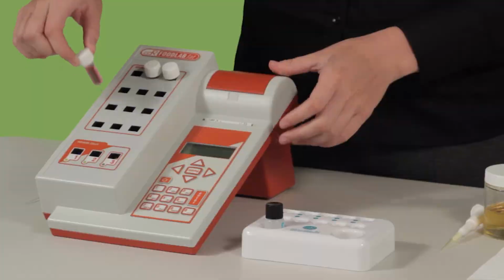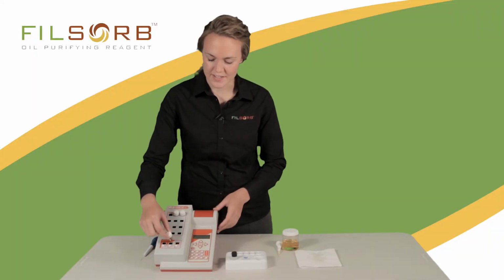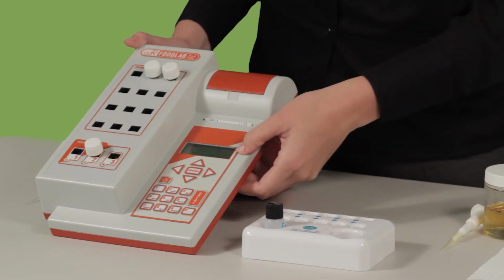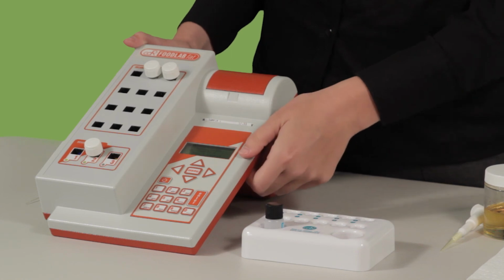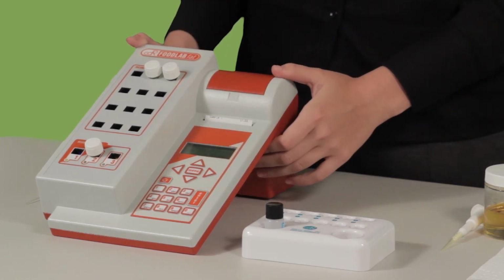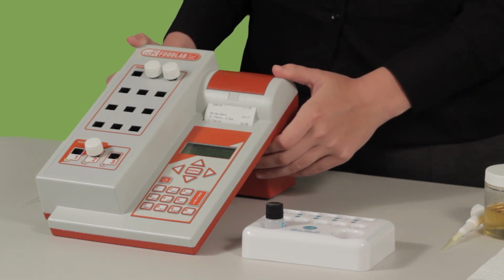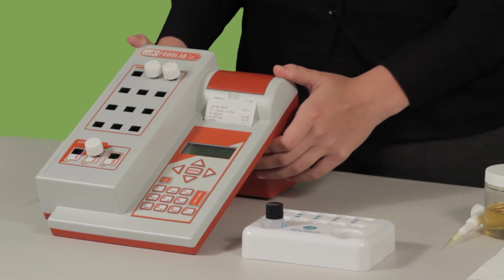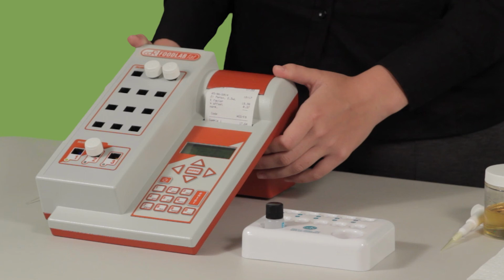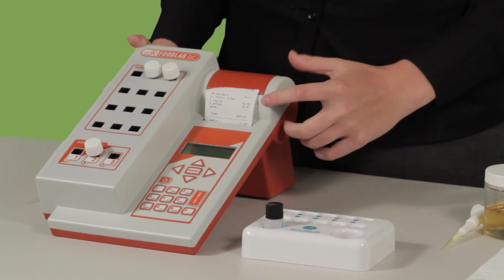After that, you'll want to invert the cuvette one last time and insert it in reading cell 2. You'll then press enter. When the test is done, a stop will appear on the screen. You will push the up arrow. Your PV or peroxide value will now be read on the screen and on your printout.